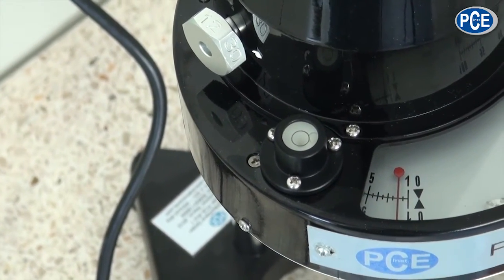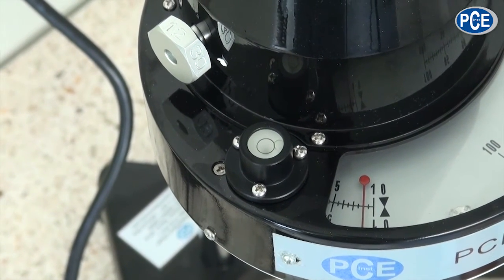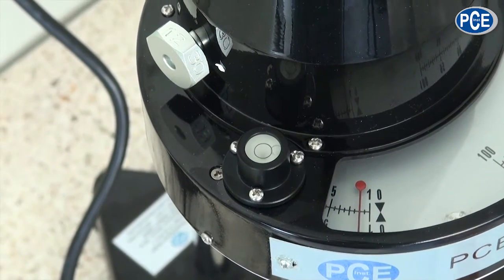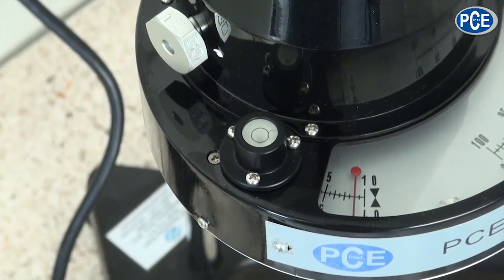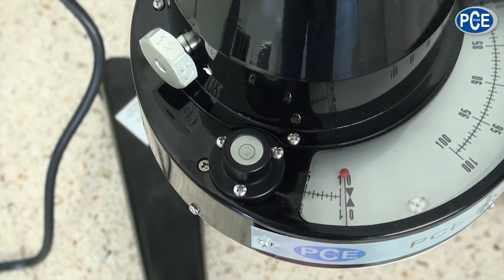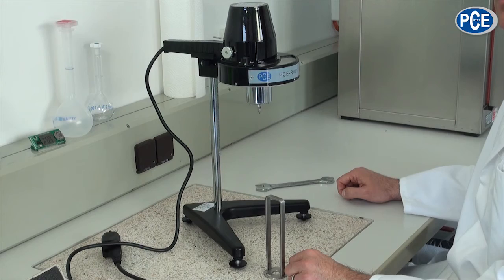The viscometer is now fixed to the standing pole and now we have to level it with the help of the screwable feet and with the help of the spirit level. As you can see the viscometer is set leveled properly, you can see it on the spirit level.